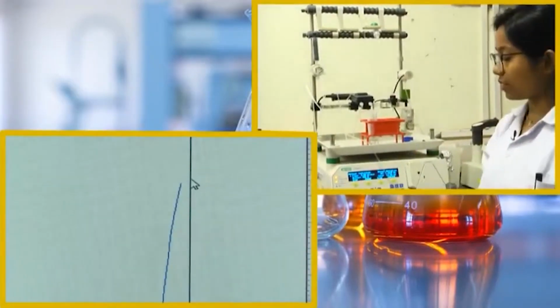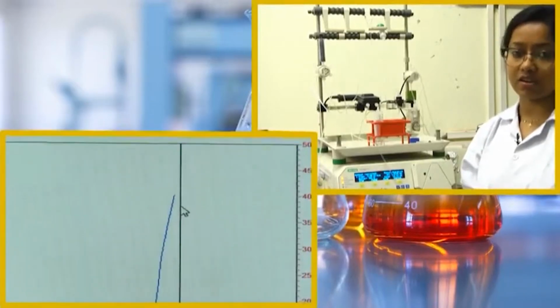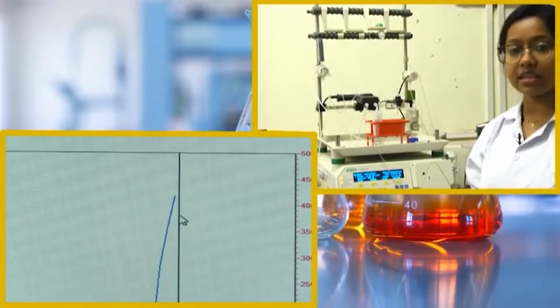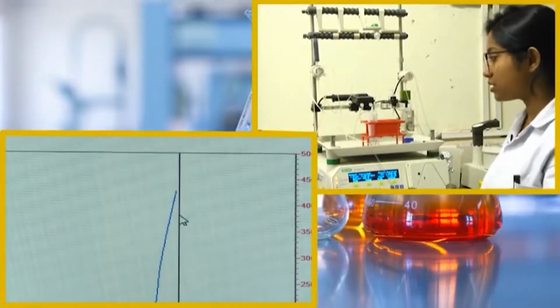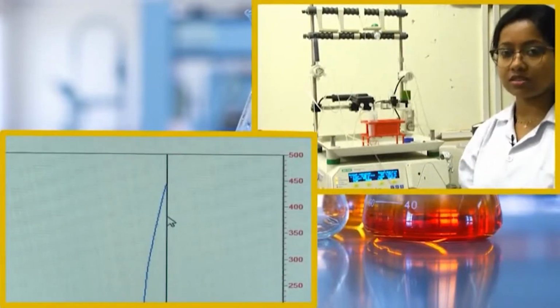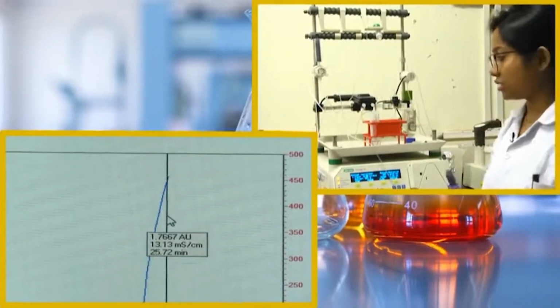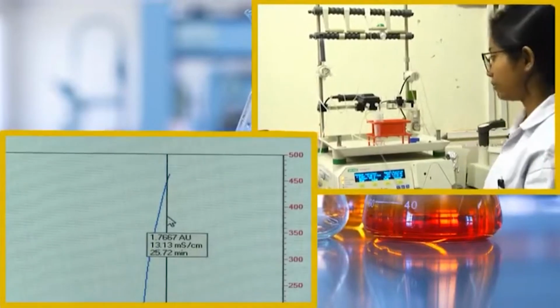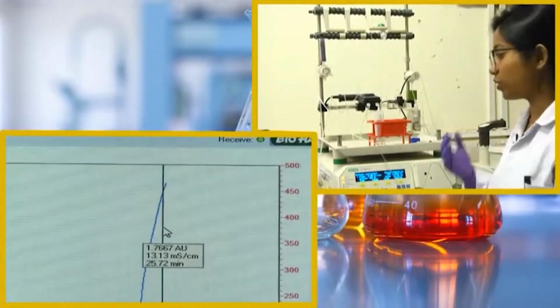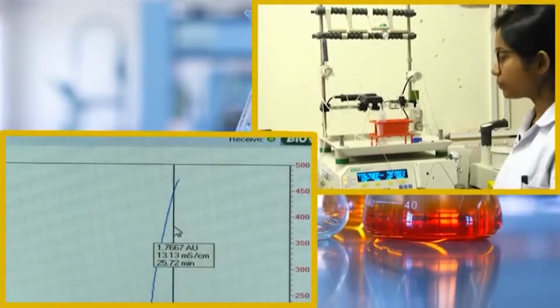You should also save, as I mentioned, this particular collection in a different tube, and while you run an SDS-PAGE, you should check if your protein is there or not. If your protein is in the wash solution, that means either the His tag has been chopped off by other proteases, or your protein might be getting degraded, and that is why it is coming out in the wash solution. If that happens, then you need to modify the purification protocol, the steps you are following, otherwise you will not get a pure protein, because the wash solution also contains other contaminant proteins, which are bacterial proteins.